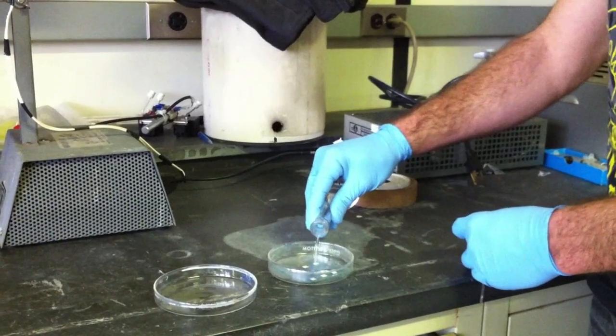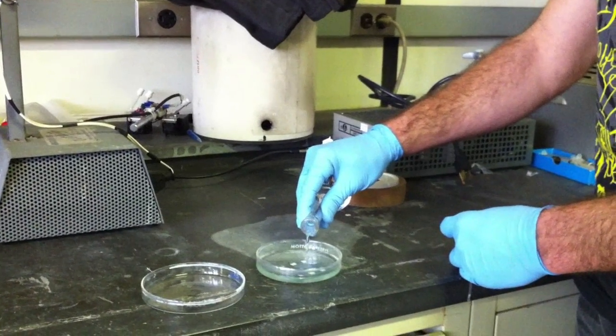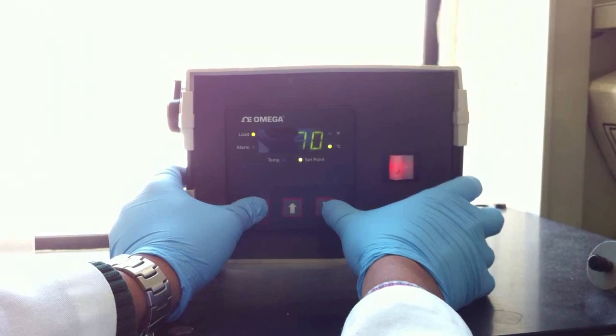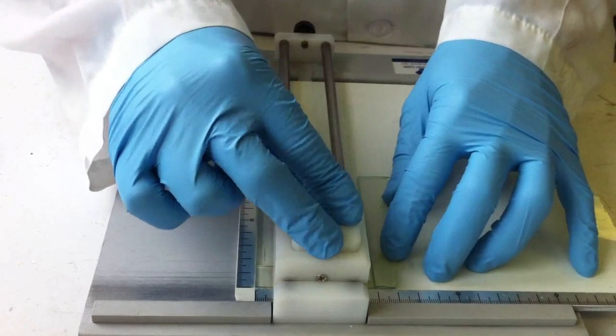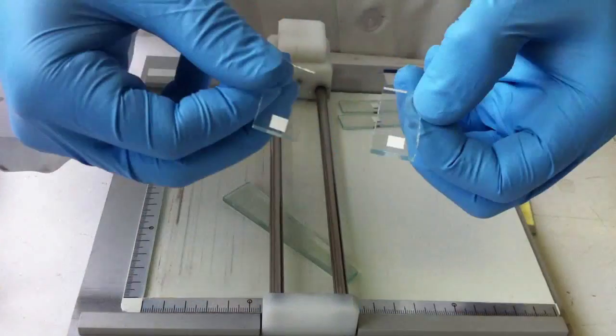Just before depositing our solar sensitizer, our photo anode is treated a second time with titanium tetrachloride to increase the surface area and improve quantum dot deposition. Individual solar cells are then cut from the optically transparent electrode.